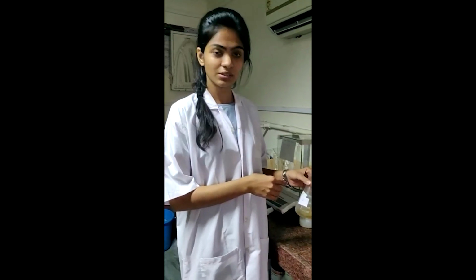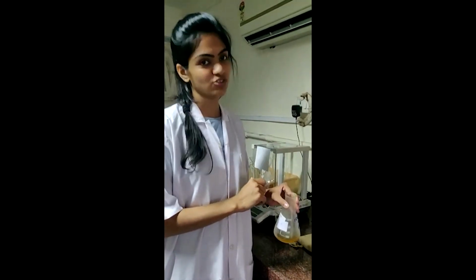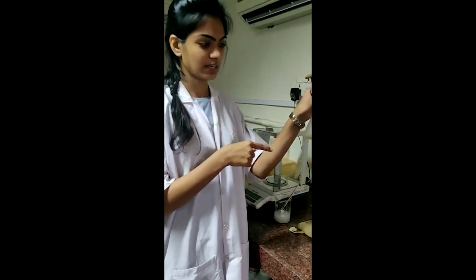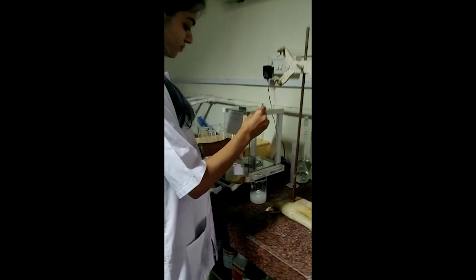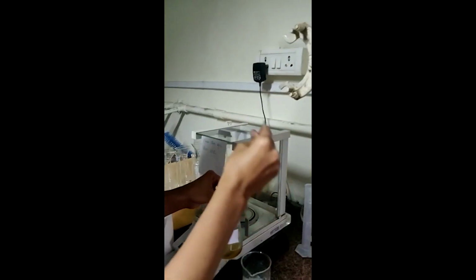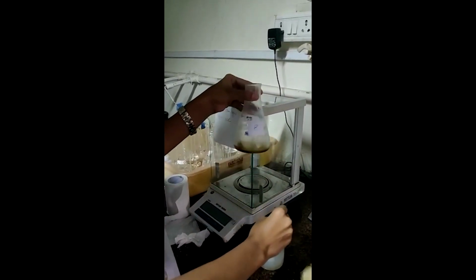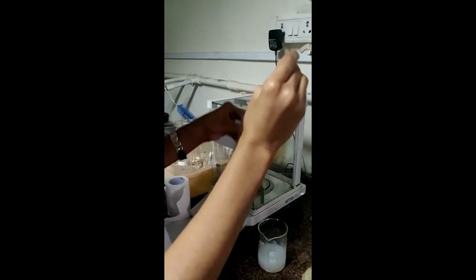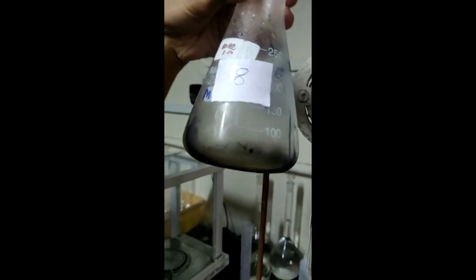For the residual chlorine determination, we took 10 ml of sample and then we added potassium iodide crystals and glacial acetic acid. We kept it in the refrigerator for 5 to 10 minutes and then took it out. Now we'll add starch indicator. See, the starch indicator, the color changed.